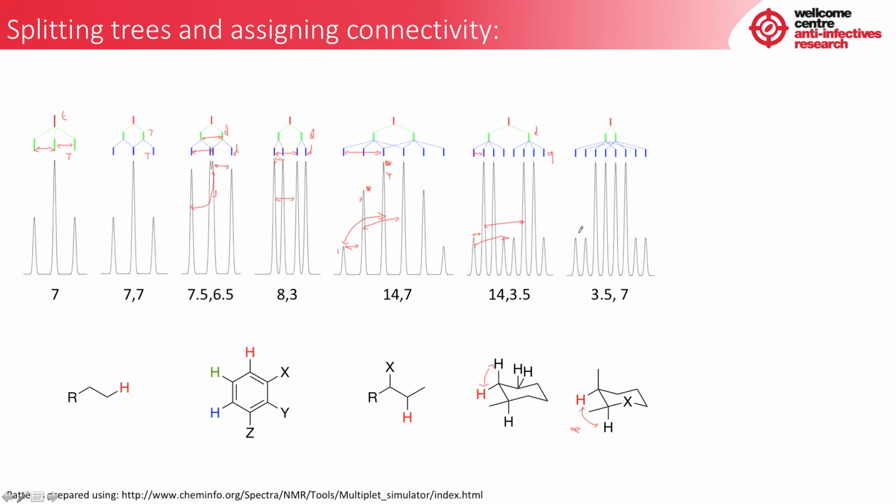And here is the first line in our first quartet, but instead of having a 3 beside it, we have another 1, and this means that this is the second quartet, and so this time this is our doublet splitting, and if we want our quartet splitting, we're actually going to have to go to here, and that is this space, and it gives us a larger J value. And so we have the same 3 examples of the same signal here, and we can distinguish what they are and their connectivity from the shapes and the J values.